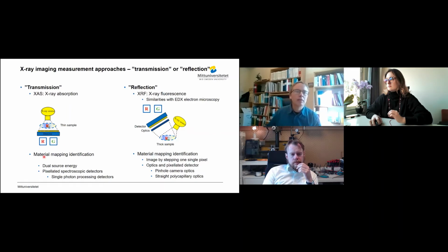Instead of a spectroscopic detector, earlier back in medical imaging, they started to diagnose brittle bone disease by running dual energy, essentially putting two voltages on their X-ray source to distinguish, and they got two different images that they could subtract. But what we have been looking at is spectroscopic imaging in the detectors.